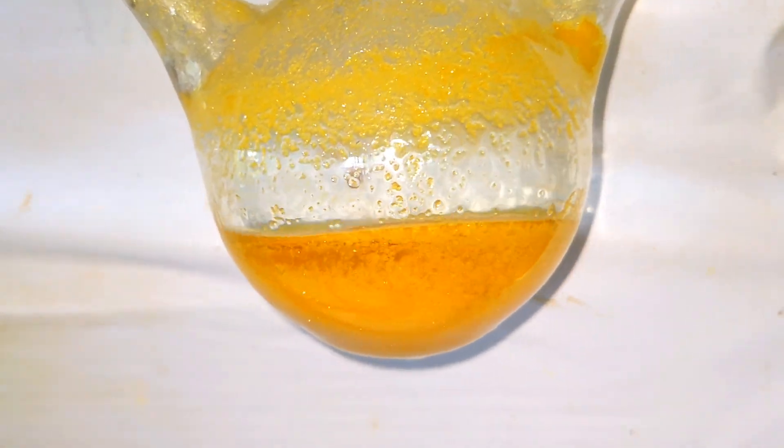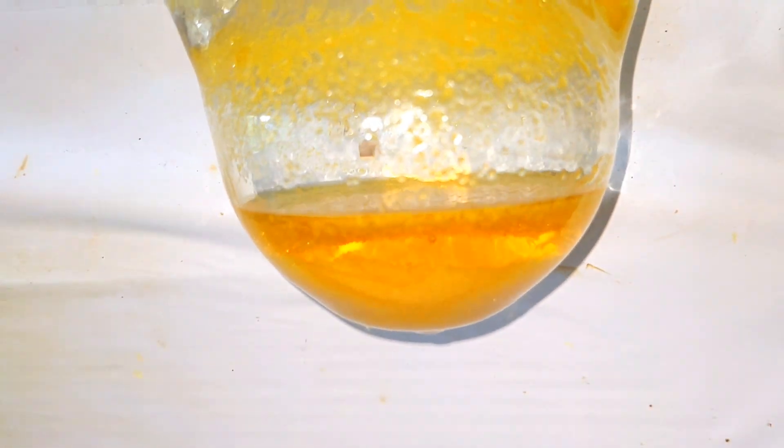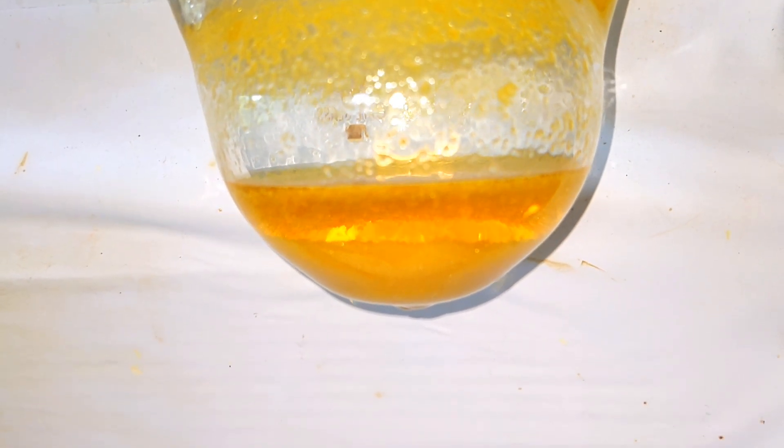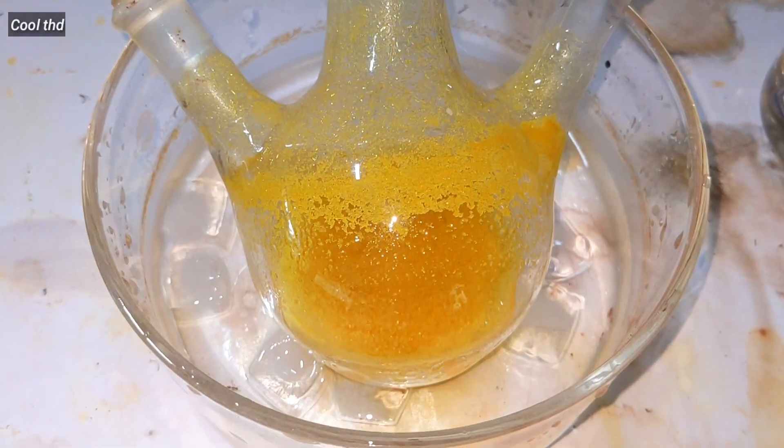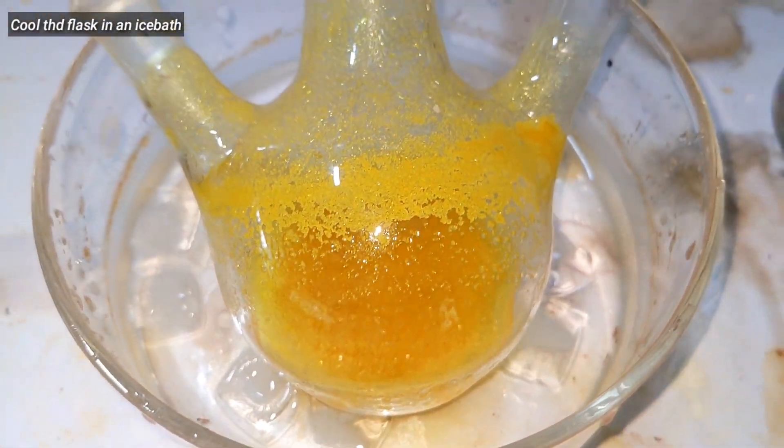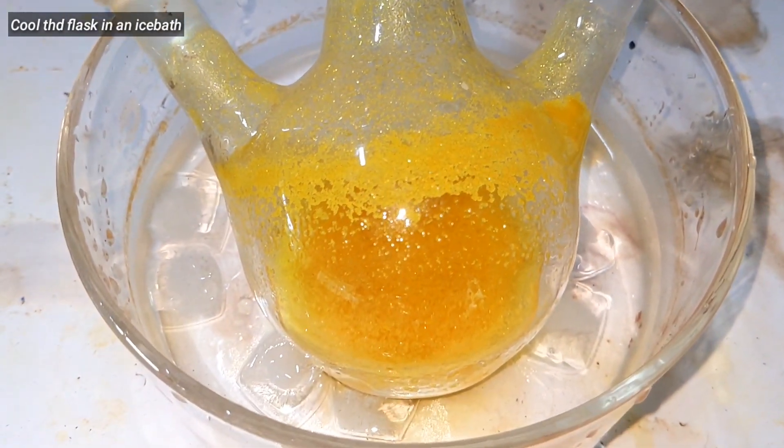After about 10 minutes we can take the flask out from the heat and let it cool down to room temperature. You can see the product settling down. Cool the flask in an ice bath so that maximum product precipitates out.